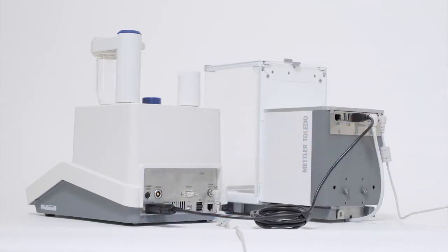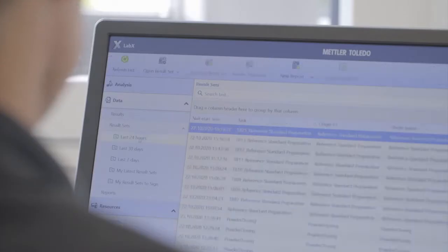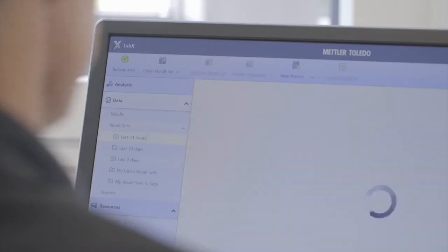Please do not hesitate to contact your local Mettler Toledo representative for the suitable solution. Last but not least the XSR balances are equipped with a built-in ethernet interface to connect the balance to an ERP or LIMS system via your local network or to the Mettler Toledo instrument control software LabX Balance.